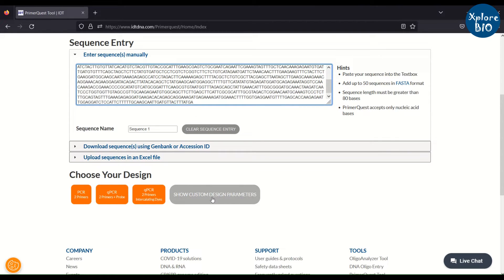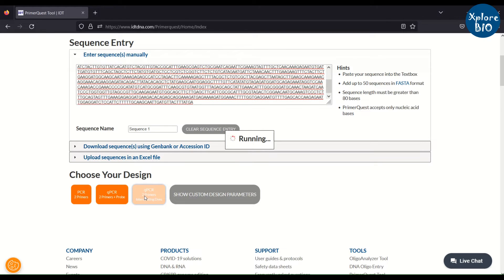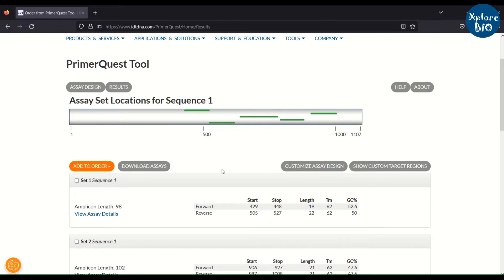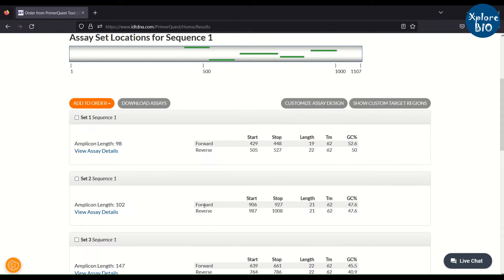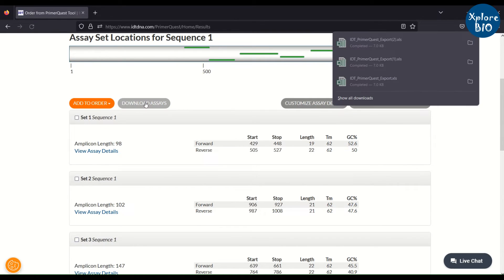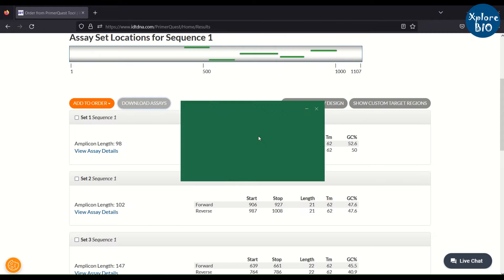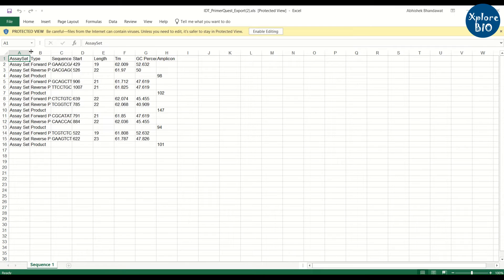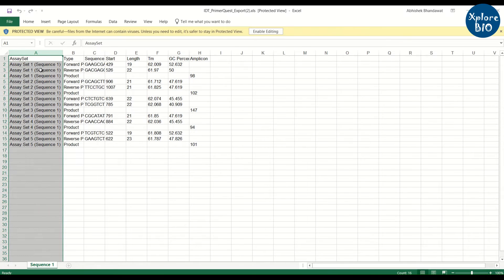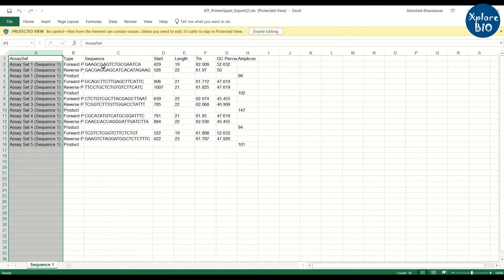I have selected qPCR primers for intercalating dye. This will show different sets of suitable qPCR primers. You can download the results in Excel and select and synthesize any of these primer sets for your real-time PCR experiments.